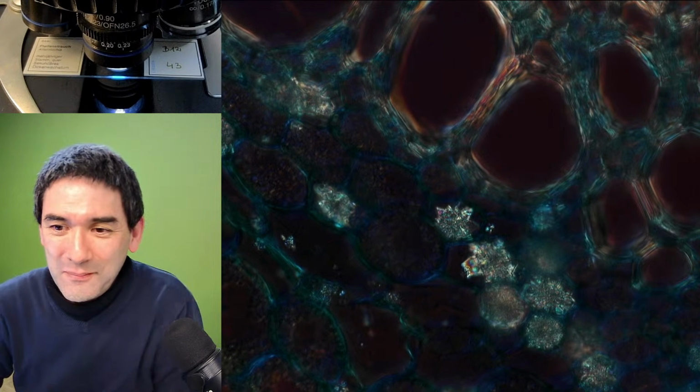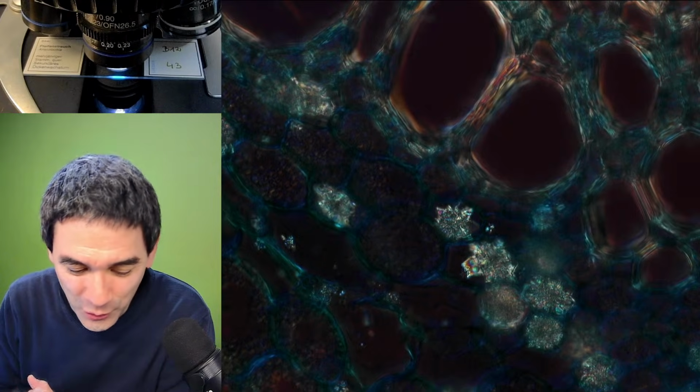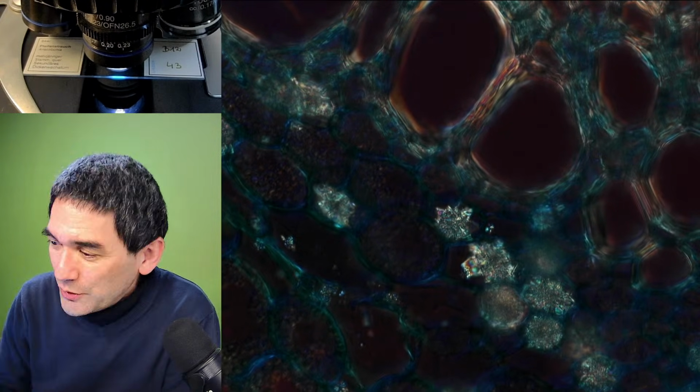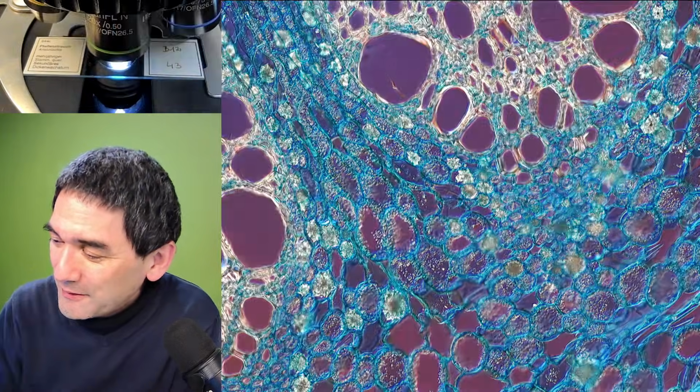What I do want to show you now is the following. I want to show you some other crystals. A microscopy friend from Germany sent them to me a couple of years ago, and this is something I really like to share with you. I've also made a video about it before, but I really want to show this to you. He sent me 3 slides. I added the labels. This was back in 2023.